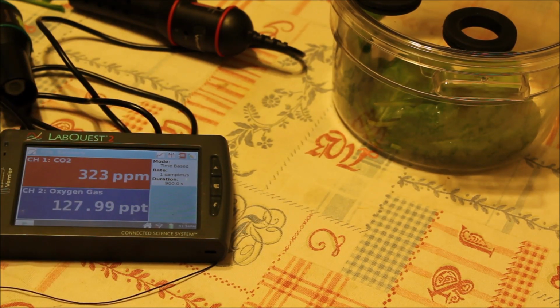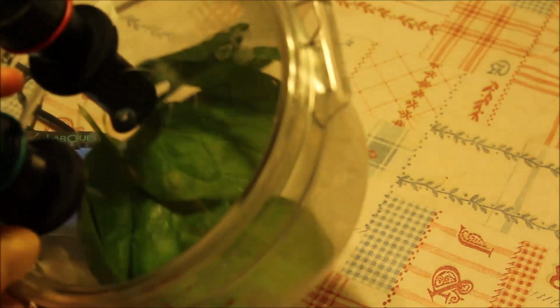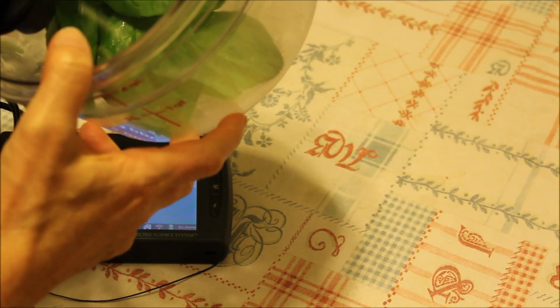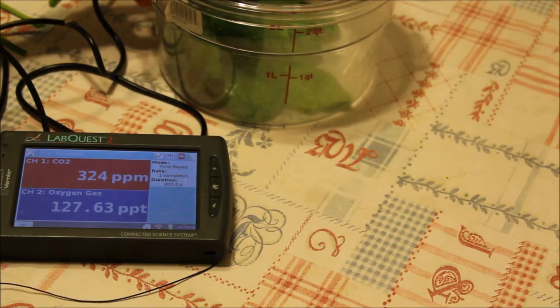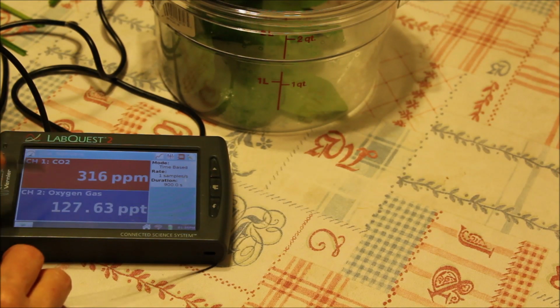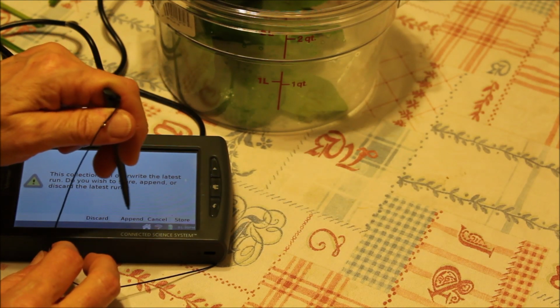Now it's pretty good. What you will do now is place the carbon dioxide sensor into one of the holes, and the oxygen sensor into another hole. When you want to check with the light, you put the light around the container on your table. And when you want to do the no light reaction, you turn off the light. In order to measure, you press the play button, and this collection overrides the latest. That's okay if it overrides.